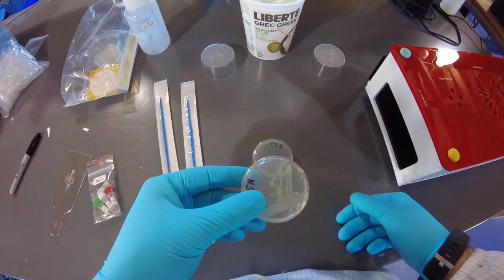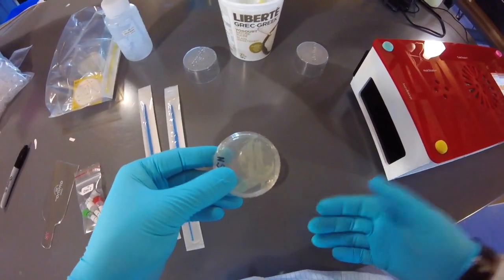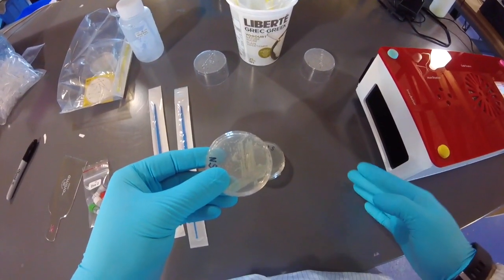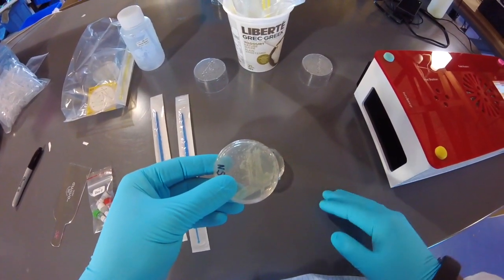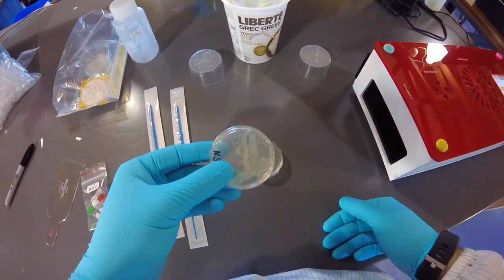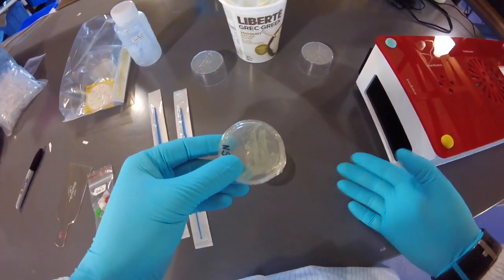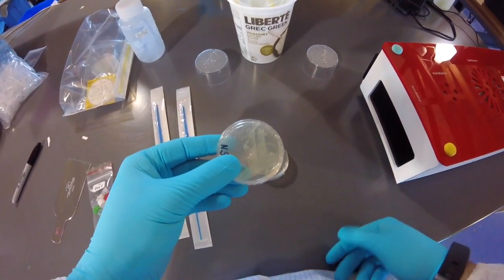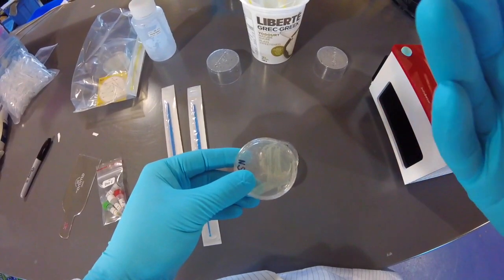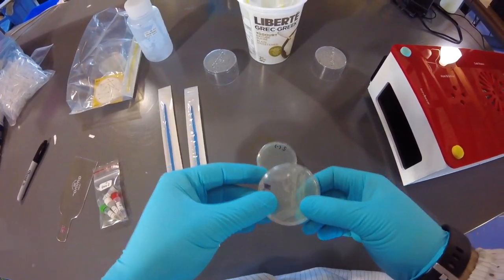Ideally, like 16 hours is great. And there was that hack that you can do if your class is 24 hours later or slightly more. You can first start by incubating at 30 degrees Celsius for the first 6-8 hours, something like that, so they grow more slowly, and then you can increase the temperature to 37 so that they pick up and they grow rapidly, because it's the rapidly growing cells that take up DNA the best.